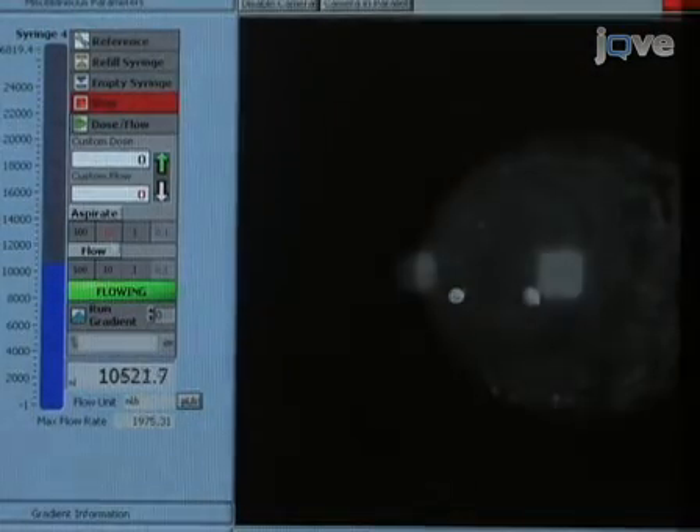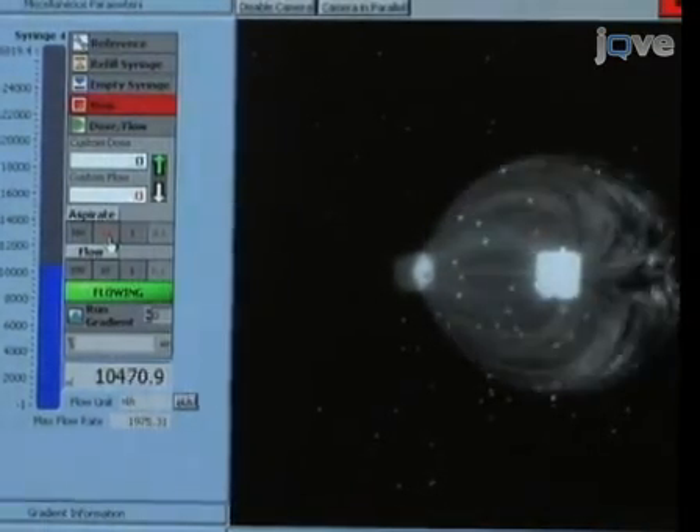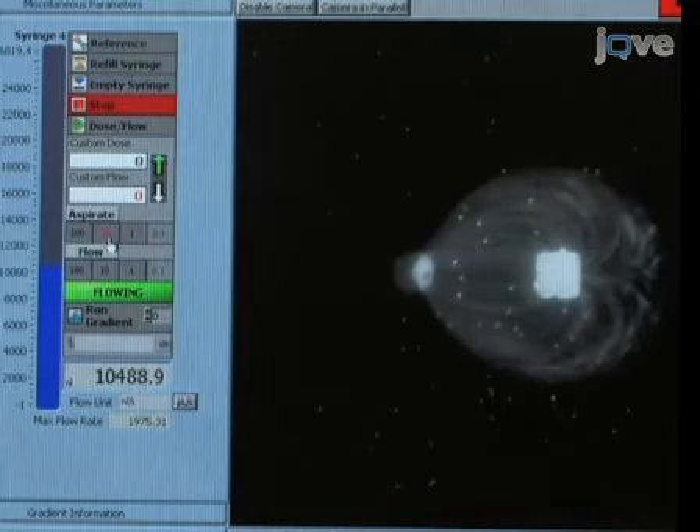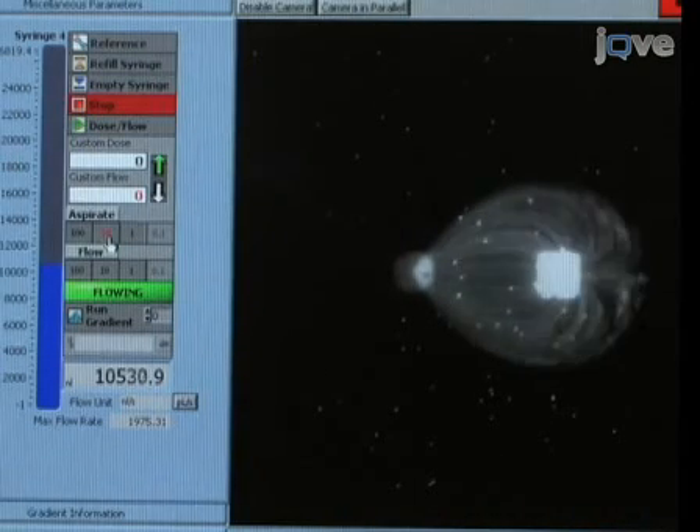We can now begin the injection of liquid while monitoring the flow and confinement of beads. The injection to aspiration ratio varies from 1:3 to 1:10, depending on the diffusivity of the reagent with the surrounding buffer and the desired geometrical flow pattern.